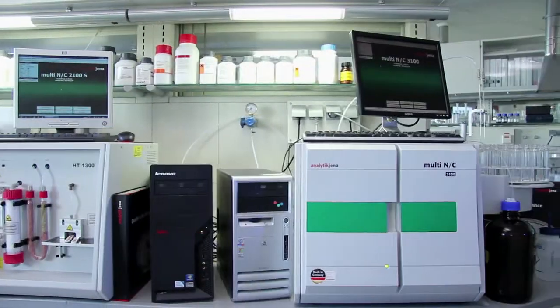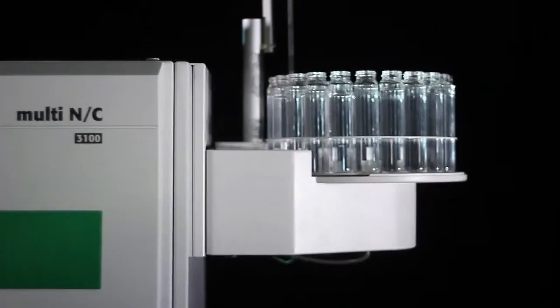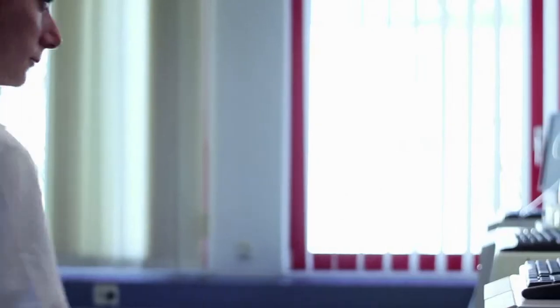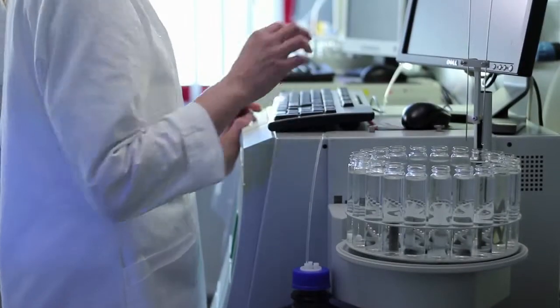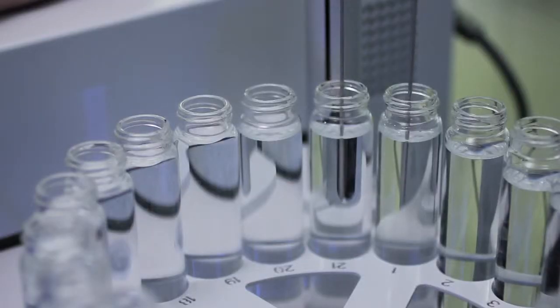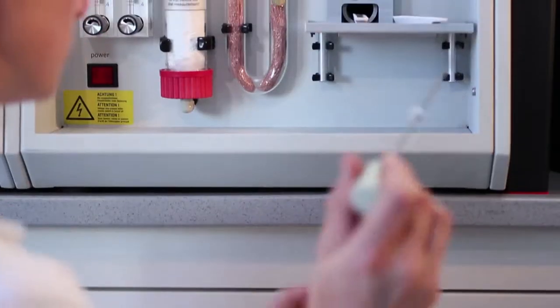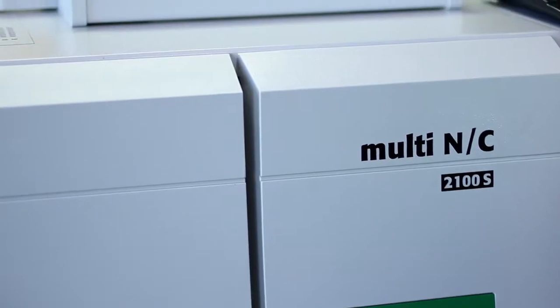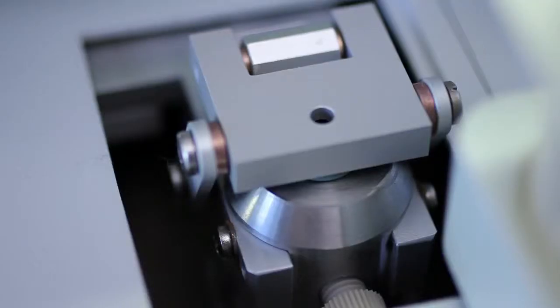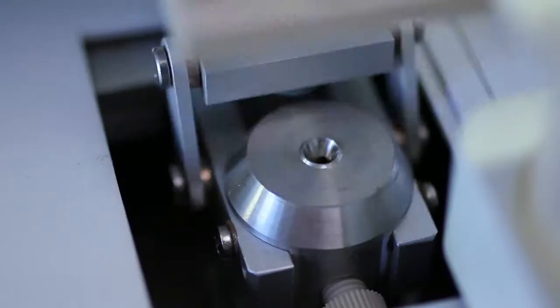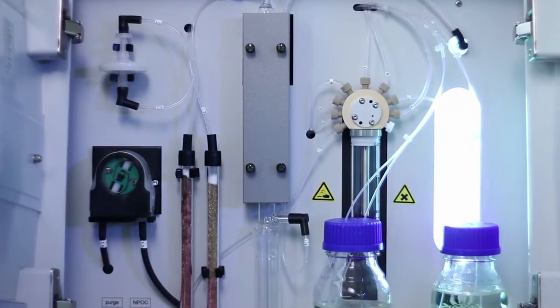The multi N/C series is a high-performance, powerful family of TOC analyzers. Multi N/C nowadays features most innovative technological solutions by the corrosion-free focus radiation NDIR detector, the most economic and efficient sample digestion technology, and the patented VitaFlow management system. The series offers the optimum solution for every application. Highest sample throughput is guaranteed by an impressive variety of autosamplers and quick injection techniques. The integrated self-check system enables reliable results.